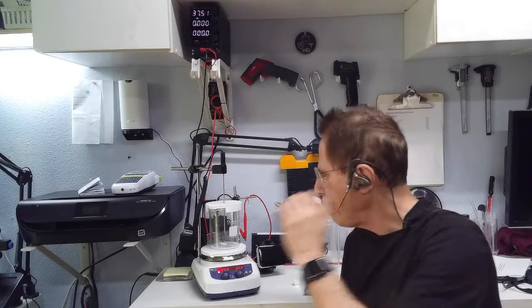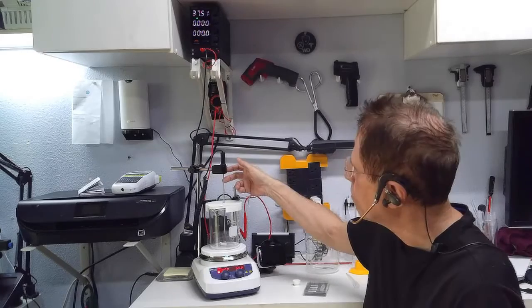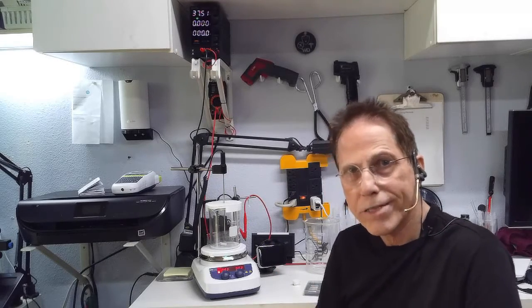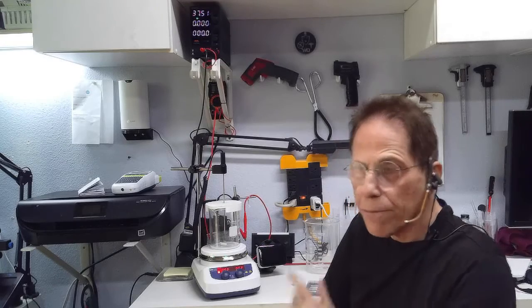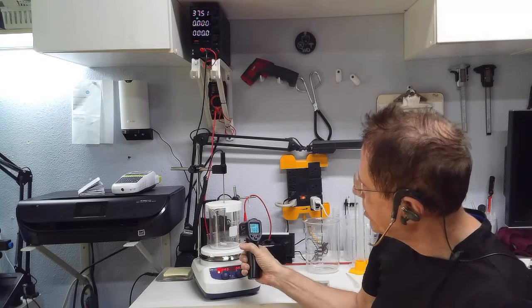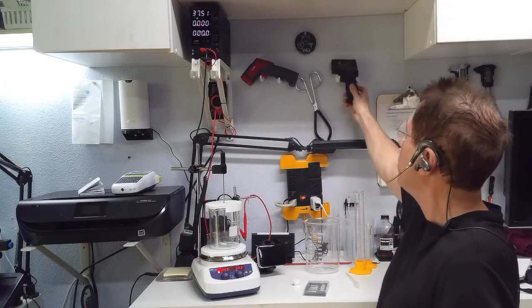It might take 20 minutes for the stirrer to bring things up to temperature. For silver it's about 60 degrees C; for gold it's 92 degrees C, almost boiling. The temperature probe makes it a lot easier — I stick it in the water, dial in the temperature, and I can walk away. This helped immensely with my production. The older stirrer didn't have the probe, so I used an infrared thermometer to check. I still use the infrared thermometer to verify the temperature even when the probe is in there doing the work.